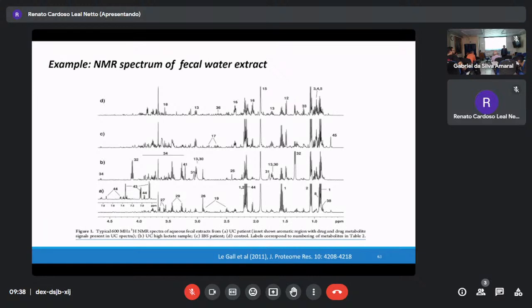Acidification? That is possible. But when you do the acidification, if the sample contains protein, it will be a problem because of the protein. After removing the protein, you have a supernatant. Then what does this supernatant contain? Lipid and some antibiotics, or some compounds from grass.